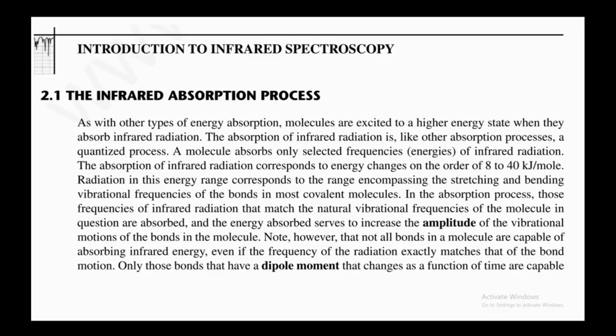So as a molecule absorbs the IR radiation, that radiation causes the molecule to vibrate, and that is detected in IR spectroscopy. And molecules that do not have a dipole moment, they are symmetrical, they do not have any separation of charges, they are going to be called IR inactive.